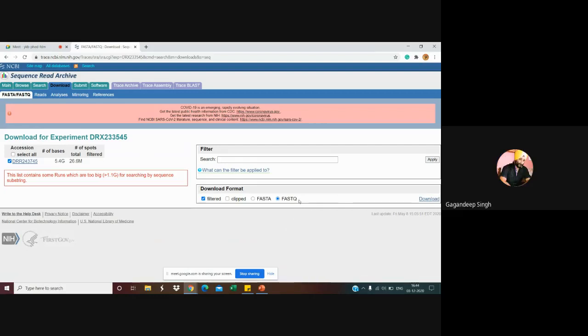Because whenever you are going to do some next generation sequencing, for FASTQ there are 4 lines, but for FASTA there is only a greater than sign and some first line. With 4 lines, you can easily find how many reads are generated, and other information for further analysis in SAM or BAM files.